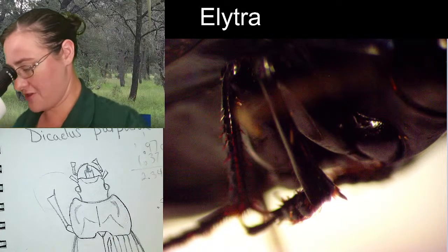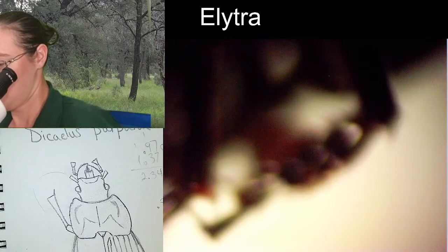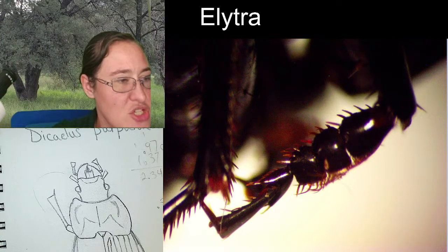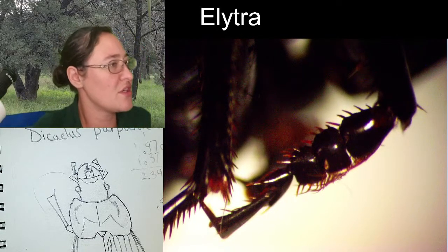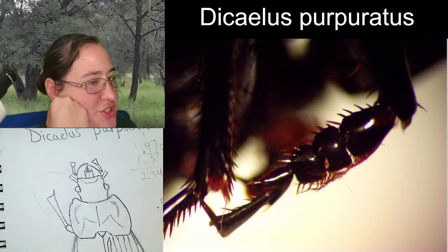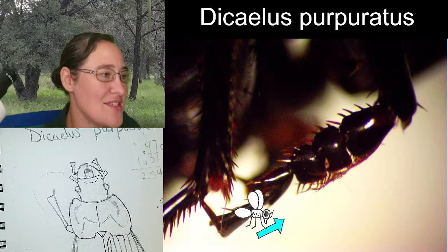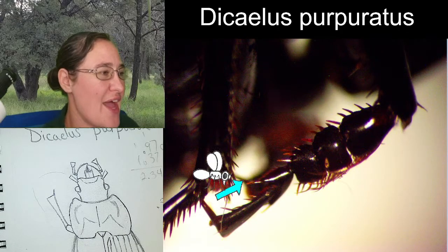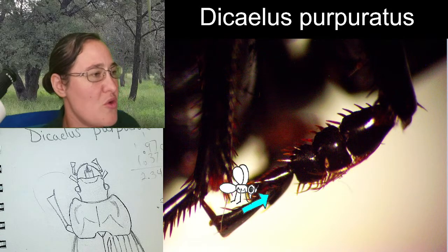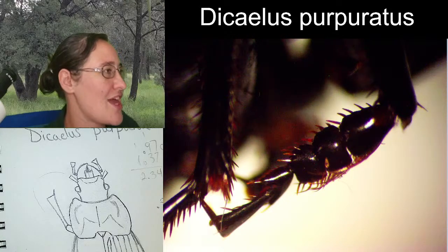And then, if we look at the tarsal segments, there are five of them. Just keep in mind that the tarsal, I'm just going to write its name here for a minute. Just keep in mind that the tarsal segments that you are looking at are technically upside down. And the way that you can tell that is if you look at this segment here, the flat or bottom side of the segment is up here on the top, because the final tarsal segment coming out of this shape of a segment is always going to come out of the top. So that's why it looks kind of funny to me.